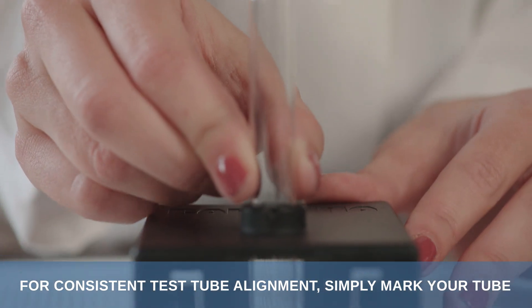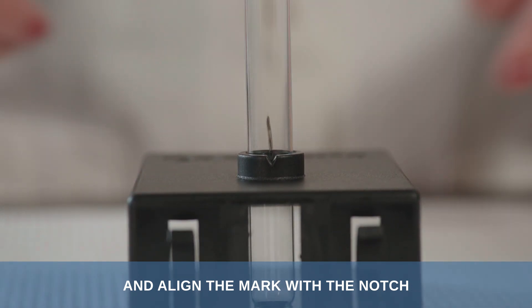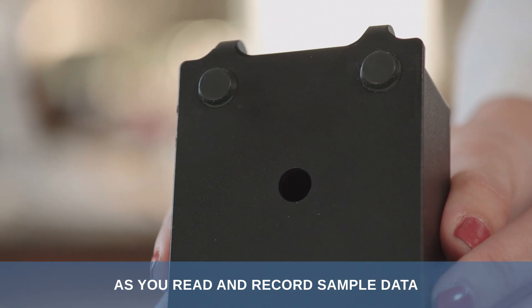For consistent test tube alignment, simply mark your tube and align the mark with the notch. The Carolina Spectroscopy Chamber also has non-slip feet to keep the device stationary as you read and record sample data.